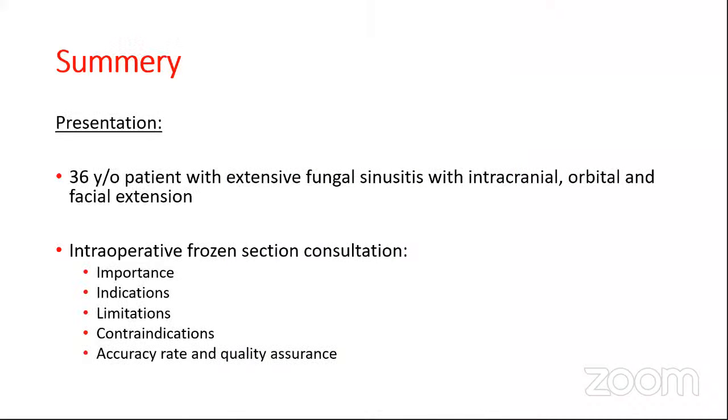So in summary, I presented to you a case of 36-year-old patient with extensive fungal sinusitis and intracranial, orbital, and facial extension of the lesion. I presented to you intraoperative frozen section consultation, importance, indications, limitations, contraindications, accuracy, and QA measurements. This is the end of my presentation.